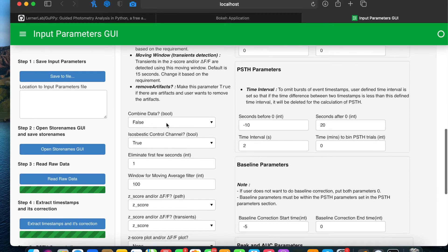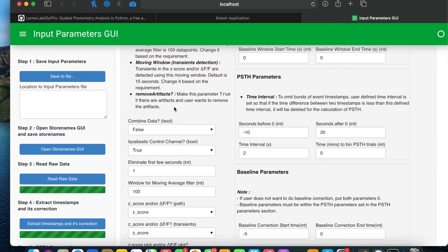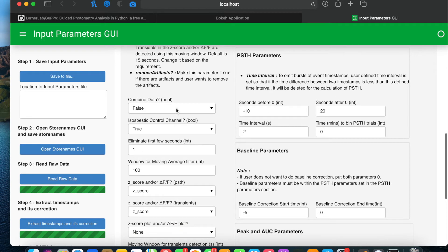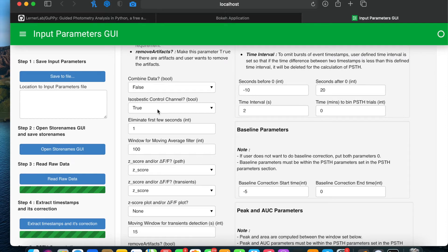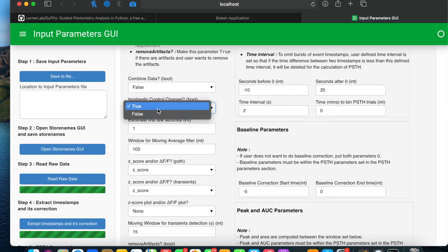The combine data parameter is by default set to false. Users can set it to true when they want to combine multiple files — for example, in a case where recording stopped midway and was started again, resulting in two different data files saved on the machine. Setting this to true will combine those files and run the analysis as one. The isos basic control channel parameter is always by default set to true, but if users don't want to use the isos basic control channel they can set it to false.